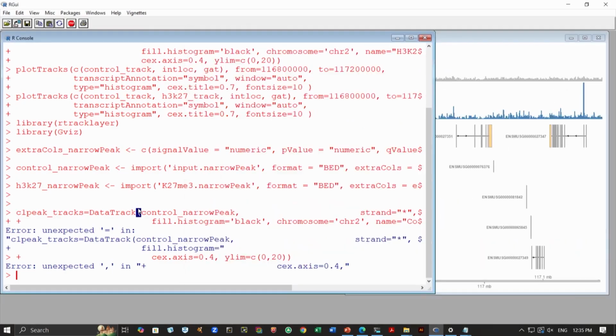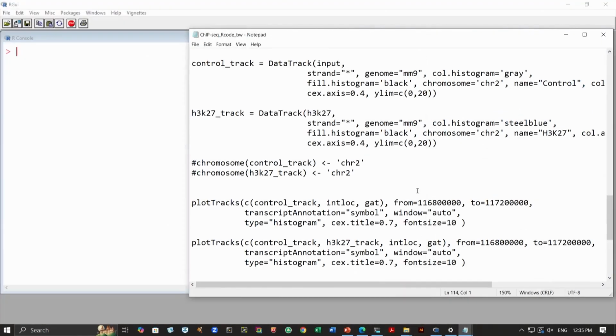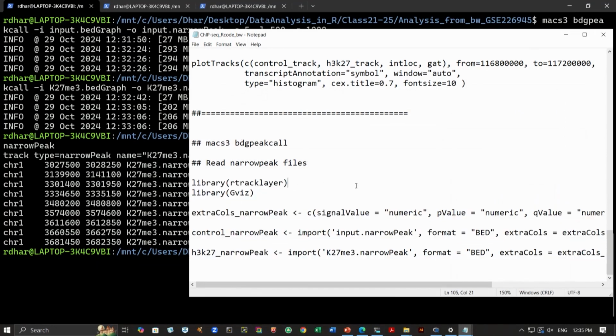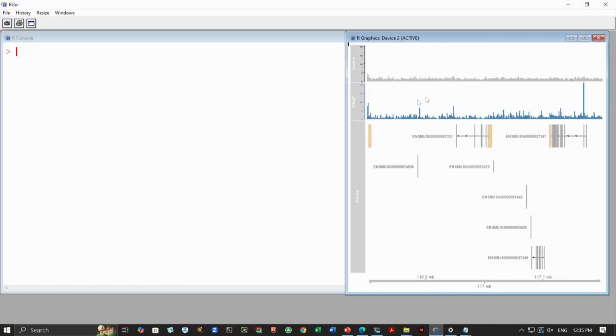Actually they will not be data tracks, they will be annotation tracks that we defined before. So, you can try this out with our program that we used in the other data set. We have to define this as annotation track, not data track, and we can put them here along with this graph. We can visualize them here along with this graph.